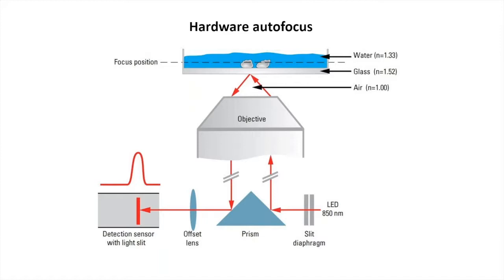Hardware autofocus, pretty much every major microscopy company now has a way to maintain focus. And it's universally based, there are fancy names for this, universally based on IR light reflection from the cover slip.